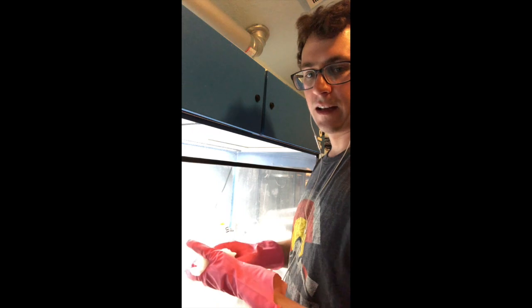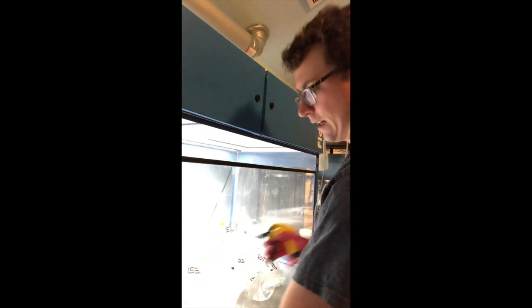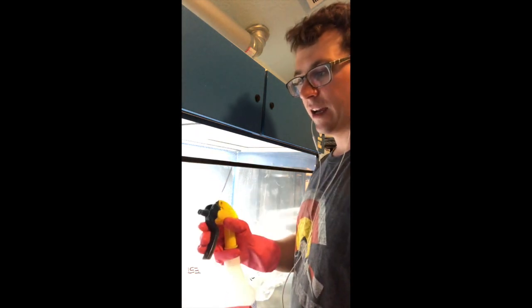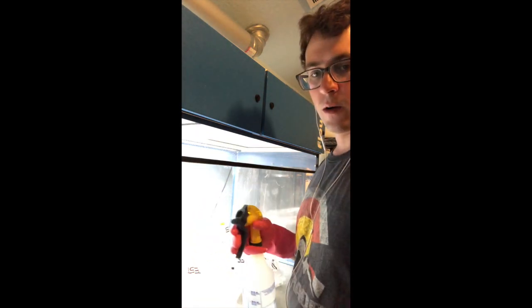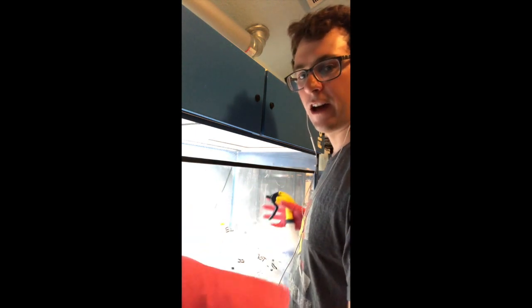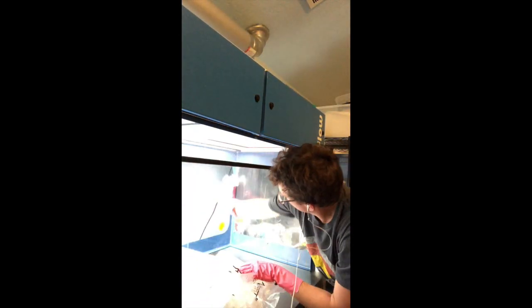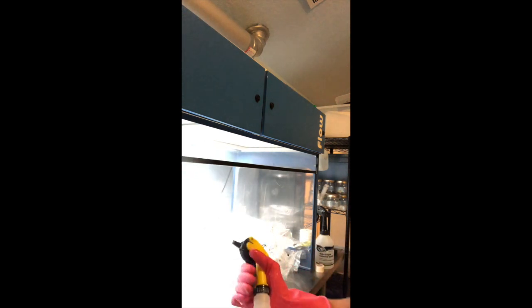So I'm going to go ahead and wipe my hood down, and then once I wipe it down, I usually spray it, give it a thorough coat of alcohol, and then when that evaporates, it's ready to pour. I'm also gonna sterilize these with bleach, so I'll have some sterile scissors to open up the packaging.